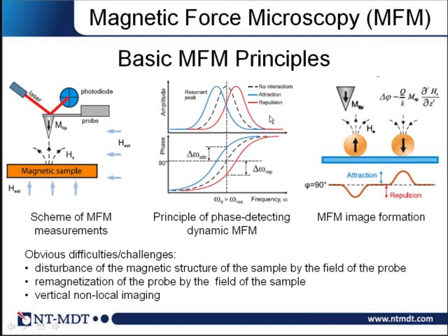Okay, we will see what it is. Well, there are some technical questions. For example, what kind of pumps are usually used? Well, it depends on what vacuum you want. If you want just a low vacuum, standard rotating pumps can be used. If you need high vacuum, turbomolecular pumps are a standard good solution. Although if it's necessary, you can use other types of pumps like cryo pumps and others. So it just depends on your application.